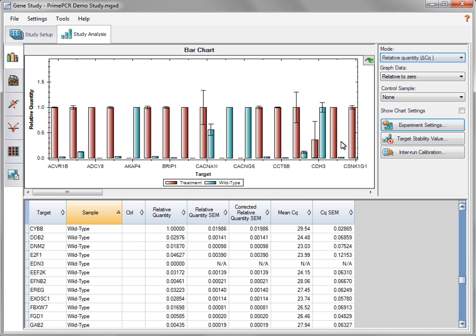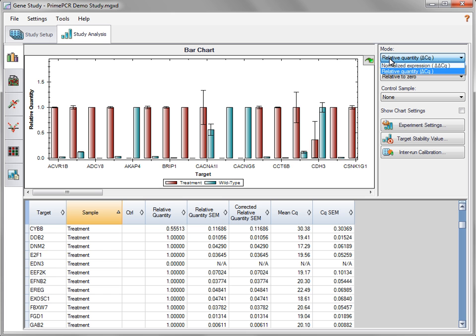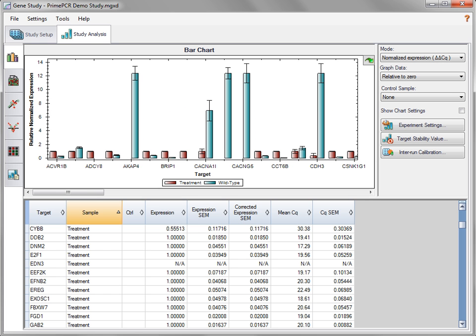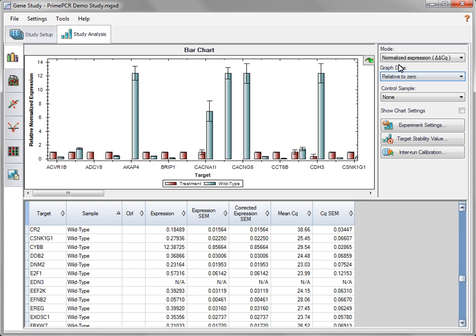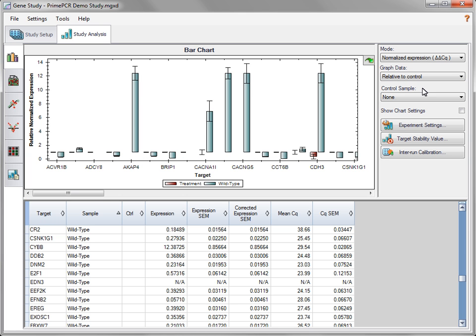Select an Analysis mode in the Bar Chart Settings pane. Choose relative quantity to quantify samples relative to the lowest CQ value for that gene of interest. Choose normalize gene expression to normalize the data using your reference gene. There are two options for how the data is graphed: Relative to zero graphs the data with the origin at zero. When relative to control is selected, the control sample is given a value of 1 and all other samples are plotted relative to this value, making it easier to visualize up and down regulation. Select a control sample from the drop-down menu.